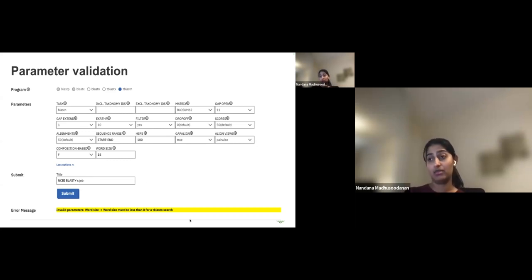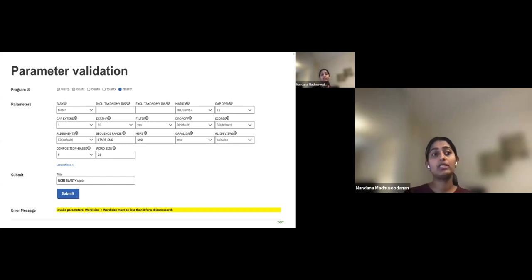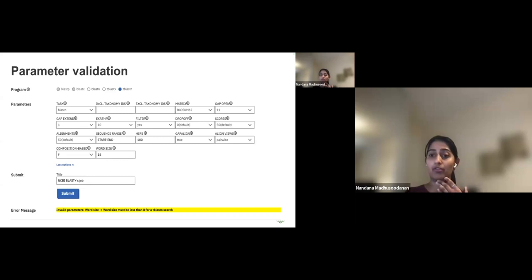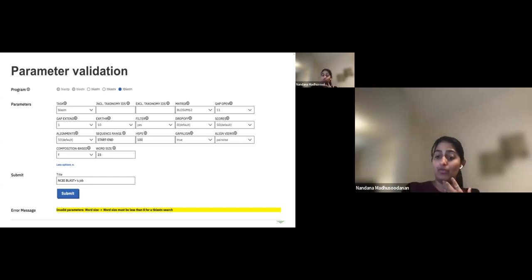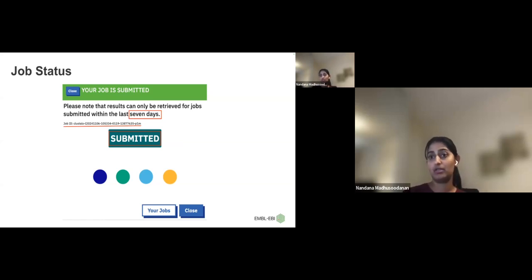We also validate parameter combinations — for example, if a user tries to provide a word size of 15 for tBLASTn, which is not sensible, we warn that a lower value should be used. Similarly, for file size limits — for Clustal Omega the limit is 4 MB — if you try to upload a larger file we will warn you and you won't be able to submit. In that case you may need to install Clustal Omega in your local environment.